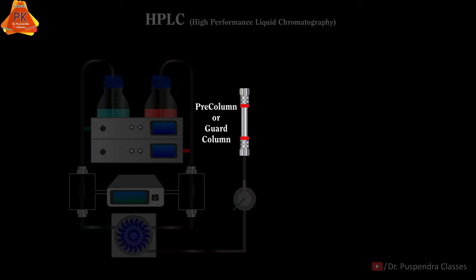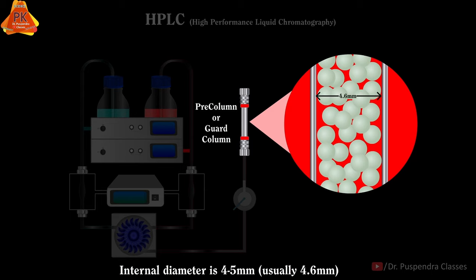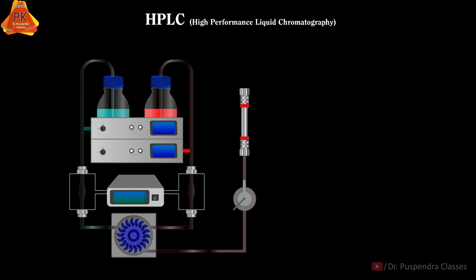The next part is the Pre-Column, which is also known as the Guard Column. The length of this column is 2 to 10 cm, and the internal diameter is 4 to 5 mm, usually 4.6 mm.